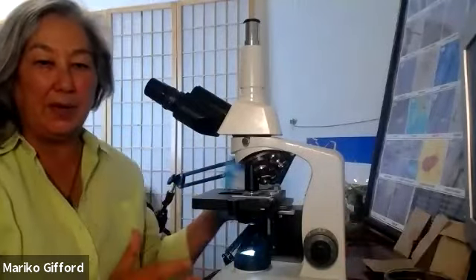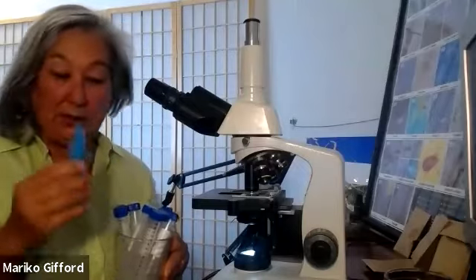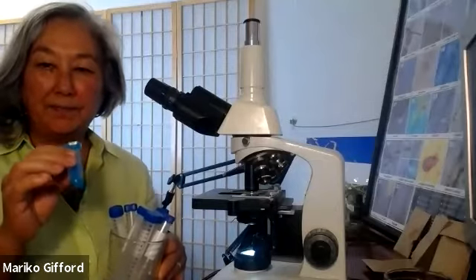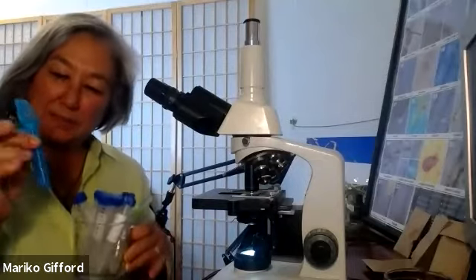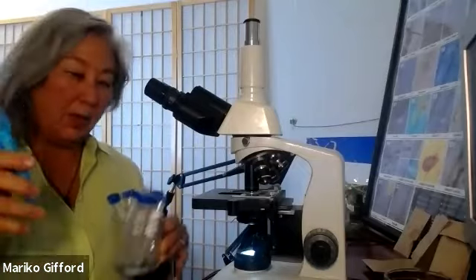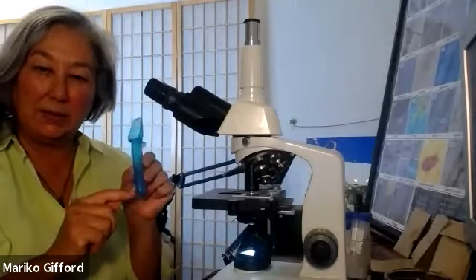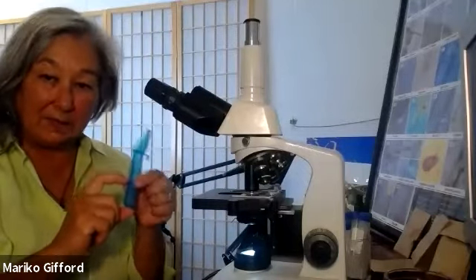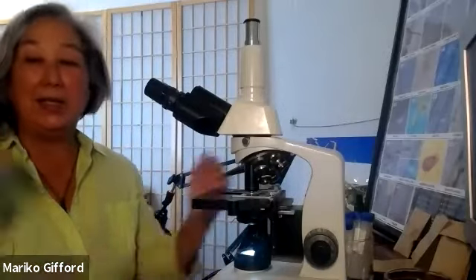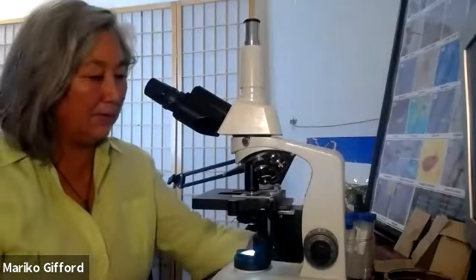I have all of my sample tubes. This is one of the ones I use. It's a baby or child's medicine container. You can put medicine there for a child. It's measured here, but I can use that to make my sample. So I'm filling the very bottom of this with soil, this 1 milliliter, and then 5 milliliters of water. And then I'm shaking and agitating that for 30 seconds, a little bit more is okay too.